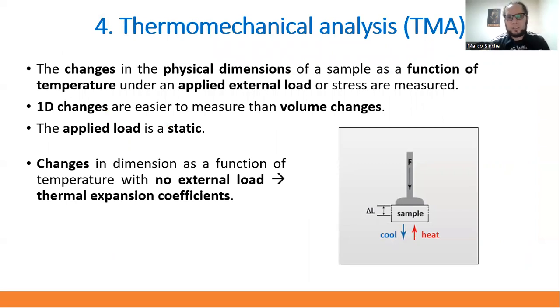The next technique is called thermomechanical analysis, and it is represented by the letters TMA. In this technique, the changes in the physical dimensions of a material as a function of temperature, due to the application of an external load or stress, are measured.